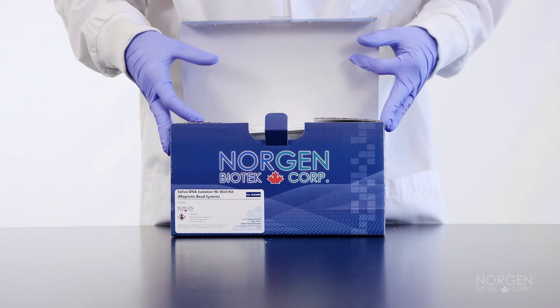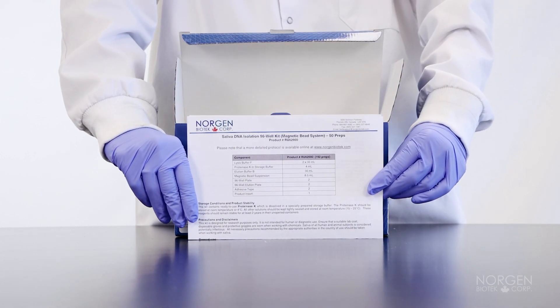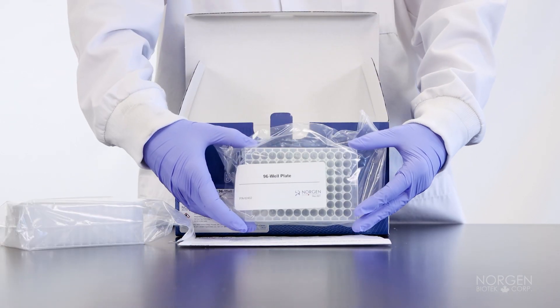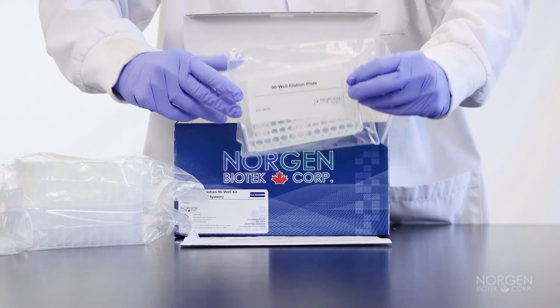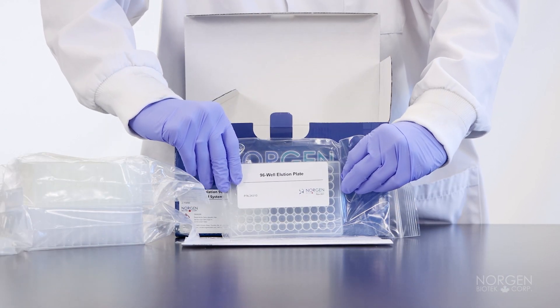Upon opening the kit, you will find a detailed product insert, two 96-well plates, two 96-well elution plates, and adhesive tape.